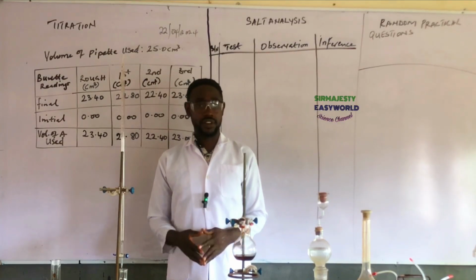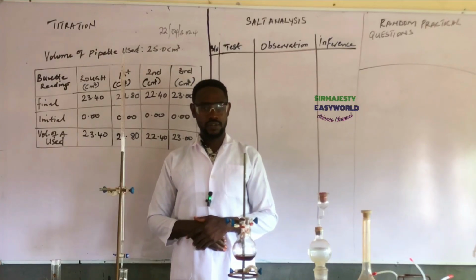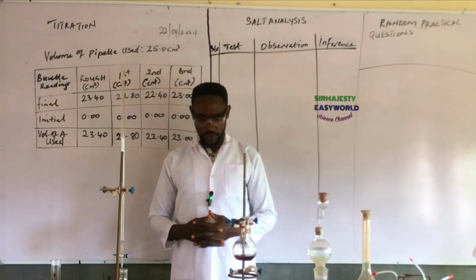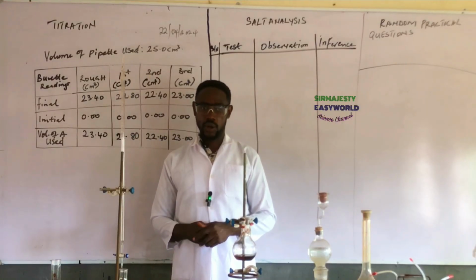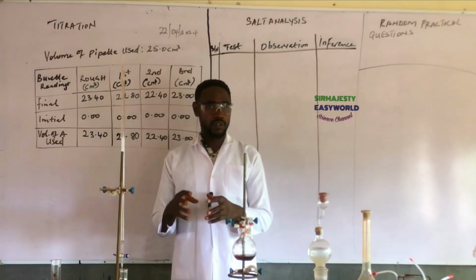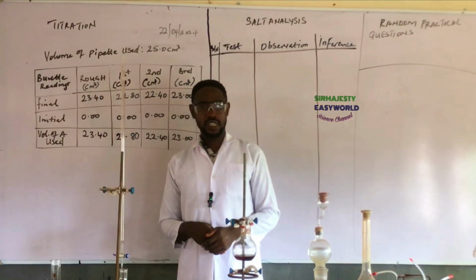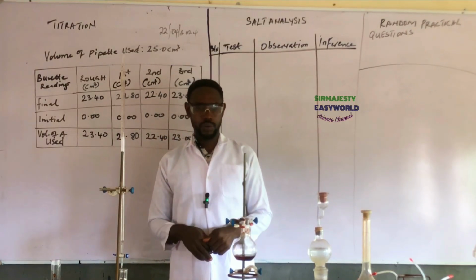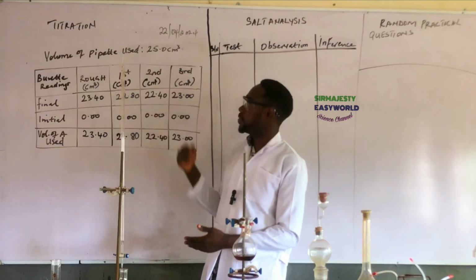So, because this is Africa, I will teach you how you can manipulate your table when your teacher has given you endpoint. And for teachers, make sure you watch till the end, or watch another video where I will teach you about the filling of the teacher's practical report. After everything, because what I'm saying is that the examiner is not there watching your procedure. They will mark your paper. That is where we give you score. And this is why I have this table here.